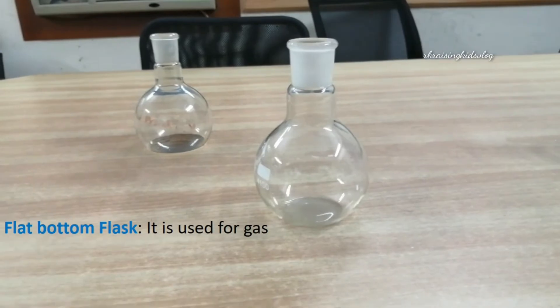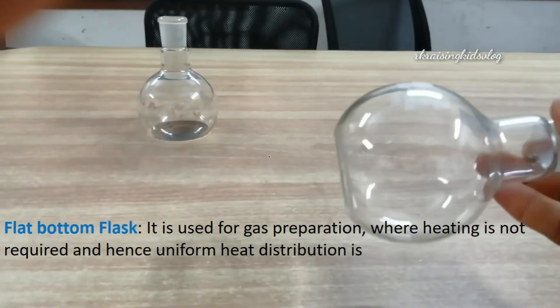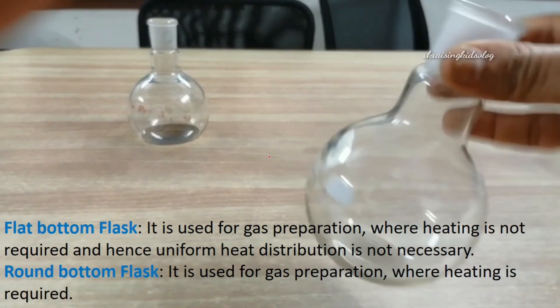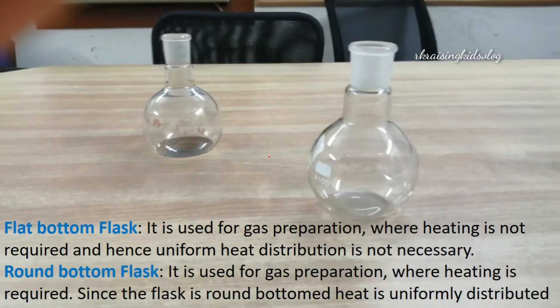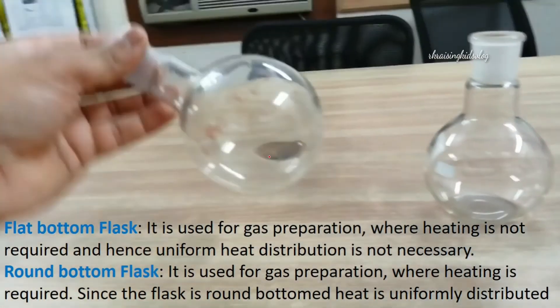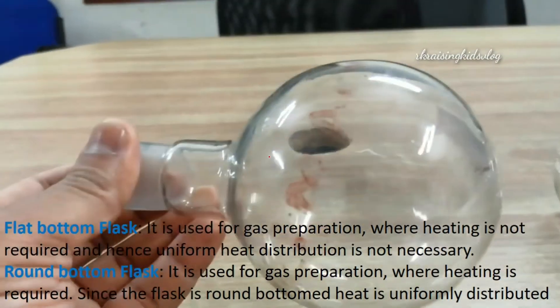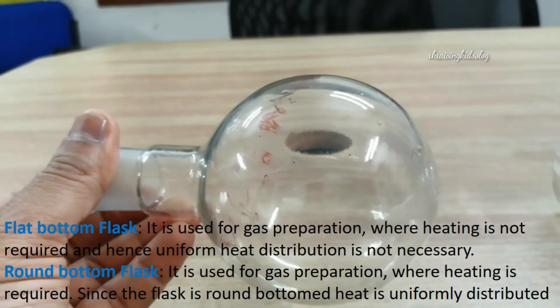Next, we'll know about the flat bottom flask. It is used for gas preparation where heating is not required, and hence uniform heat distribution is not necessary. A round bottom flask, on the other hand, is another kind of flask used for gas preparation where heating is required. Since the flask is round-bottomed, heat is uniformly distributed.